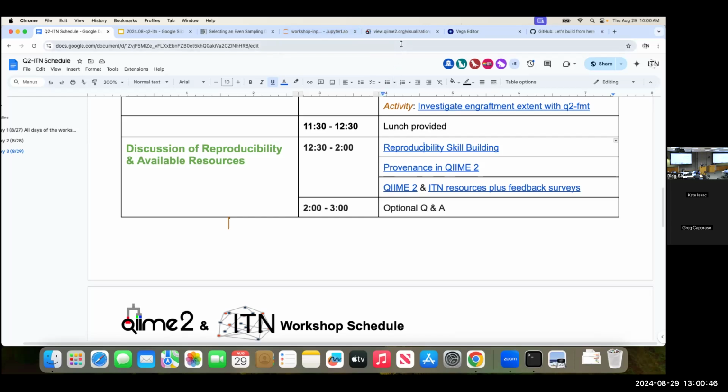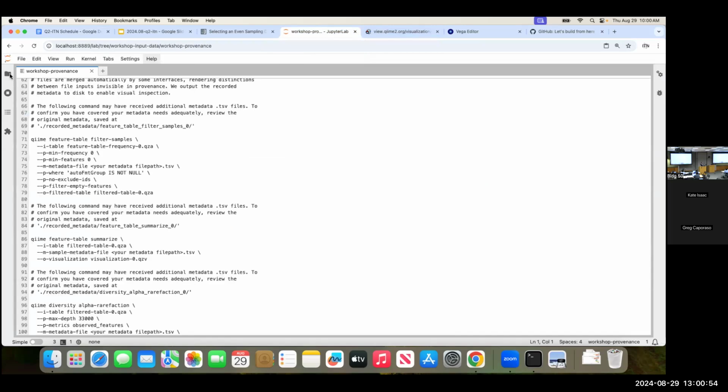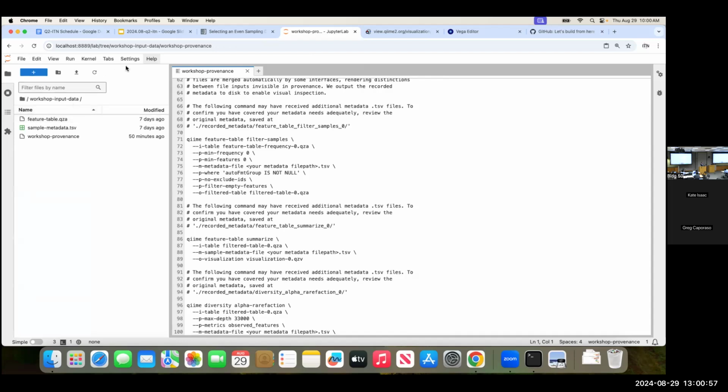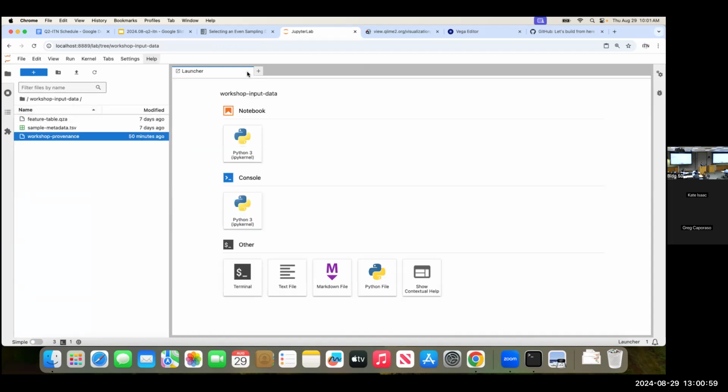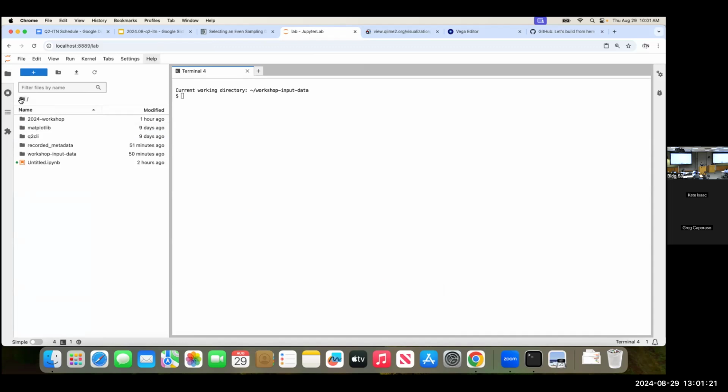If you would like to follow along with me, we're going to go back to our, I'm going to close out of this and close out of this. All right, here we go. Let's go back to the beginning here and get introduced to Provenance Replay. Oh, go back. Yeah, I see what you're saying. Yeah, sorry. All right, sweet.